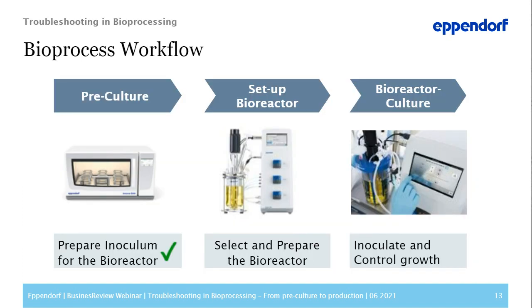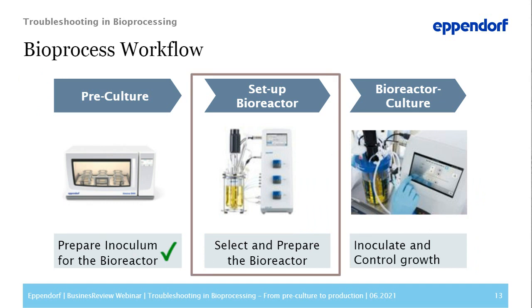So, finally, the pre-culture grows well and reproducibly. Next is going to be the selection and setup of a fermenter or bioreactor. And with this, I would like to hand over to my colleague Ankita.